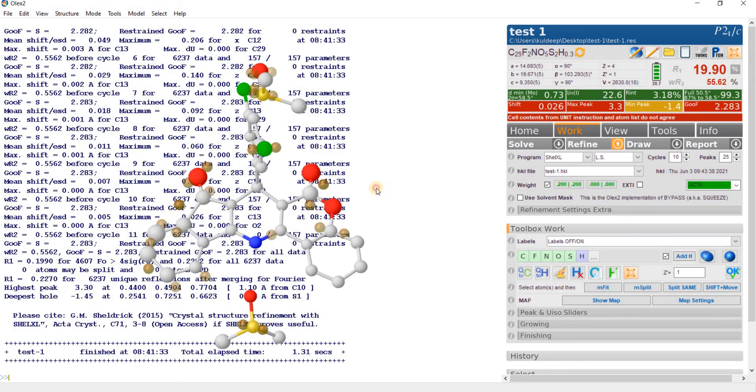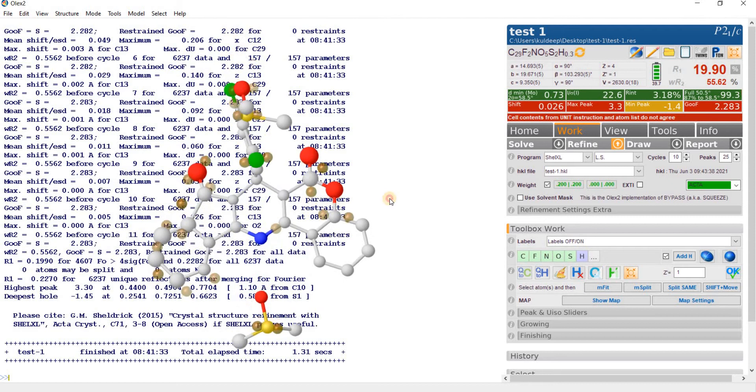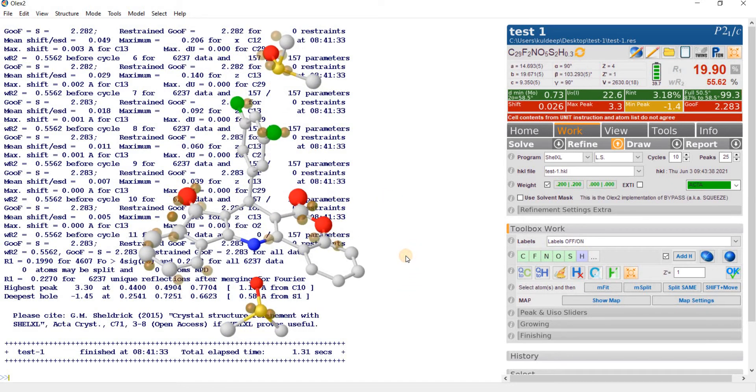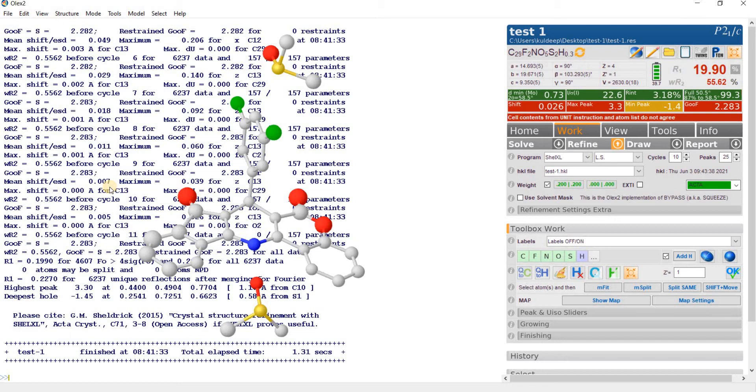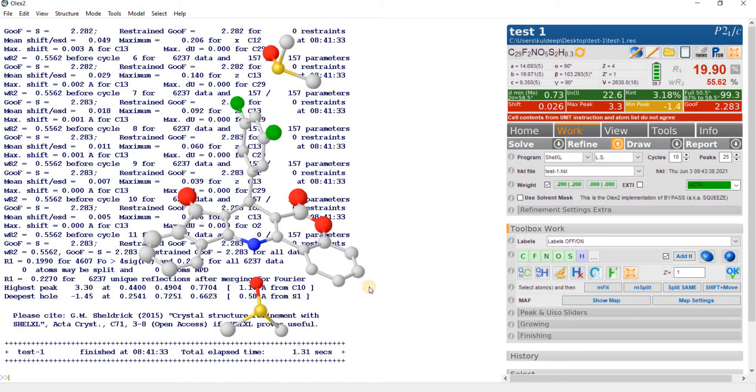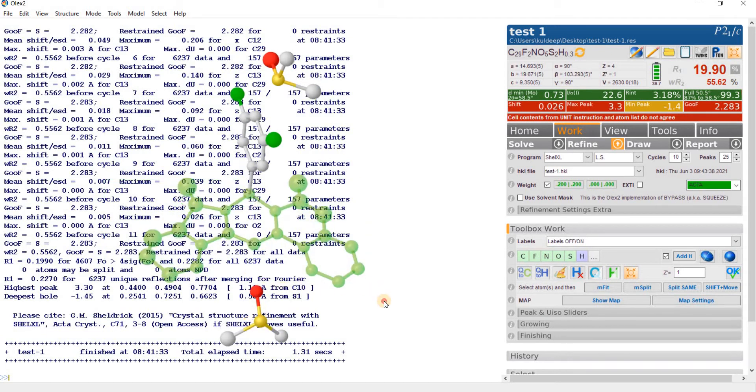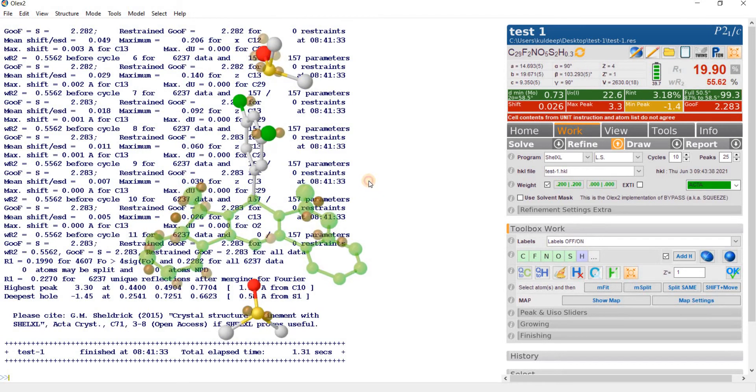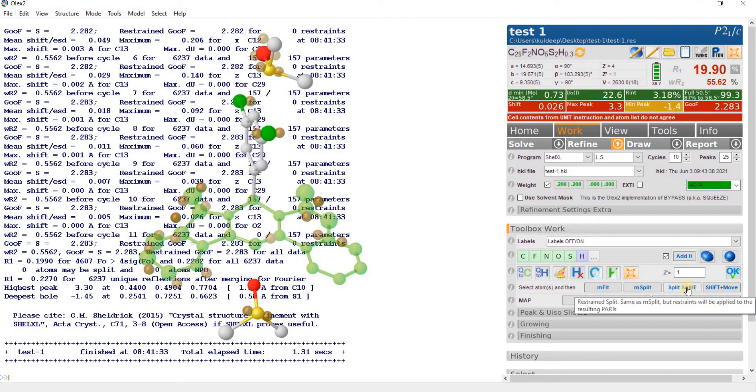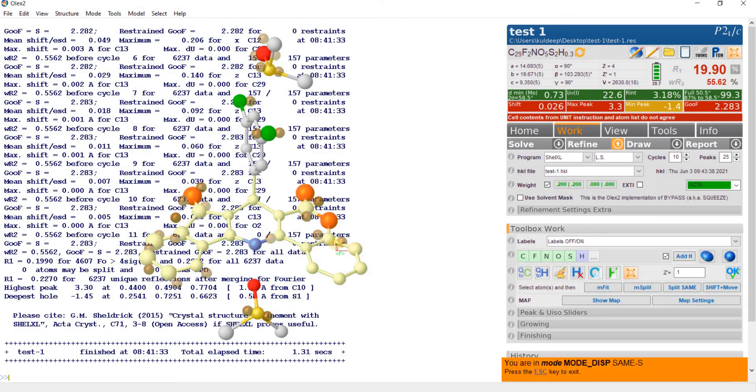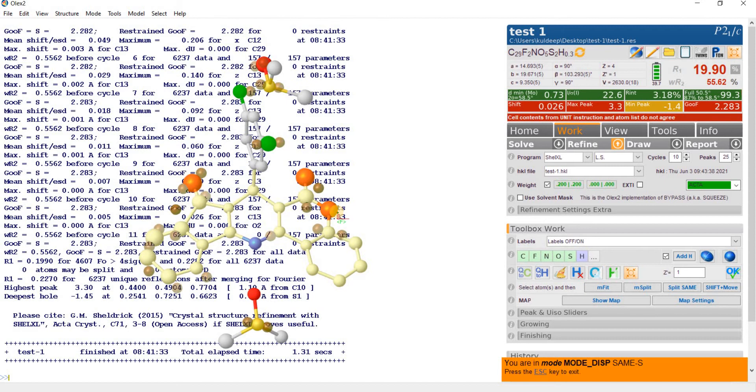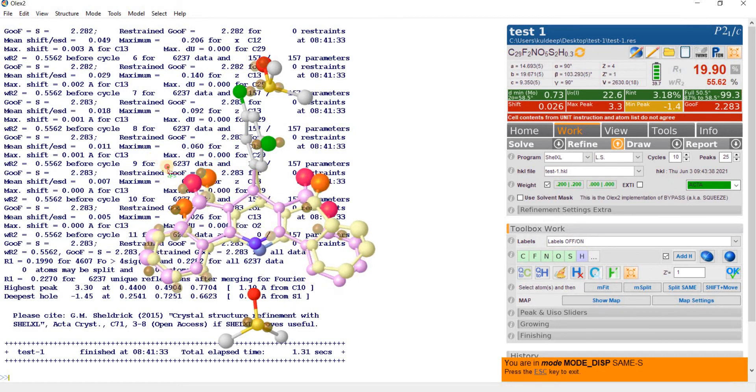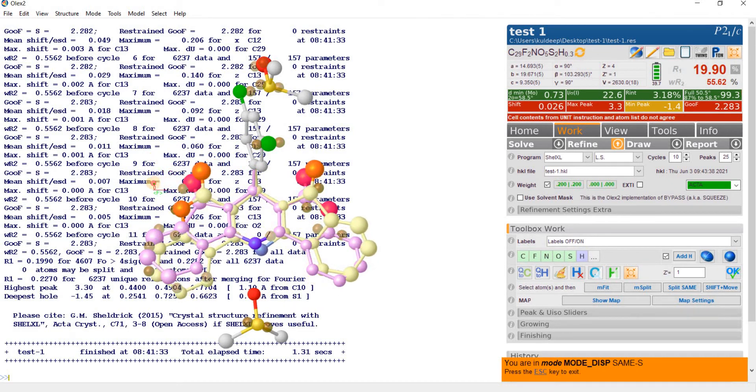So let's resolve this disorder. What we have to do, select this part which is disorder part of the molecule by pressing shift and left mouse click and this part is selected. Then go to split same, it become yellow.